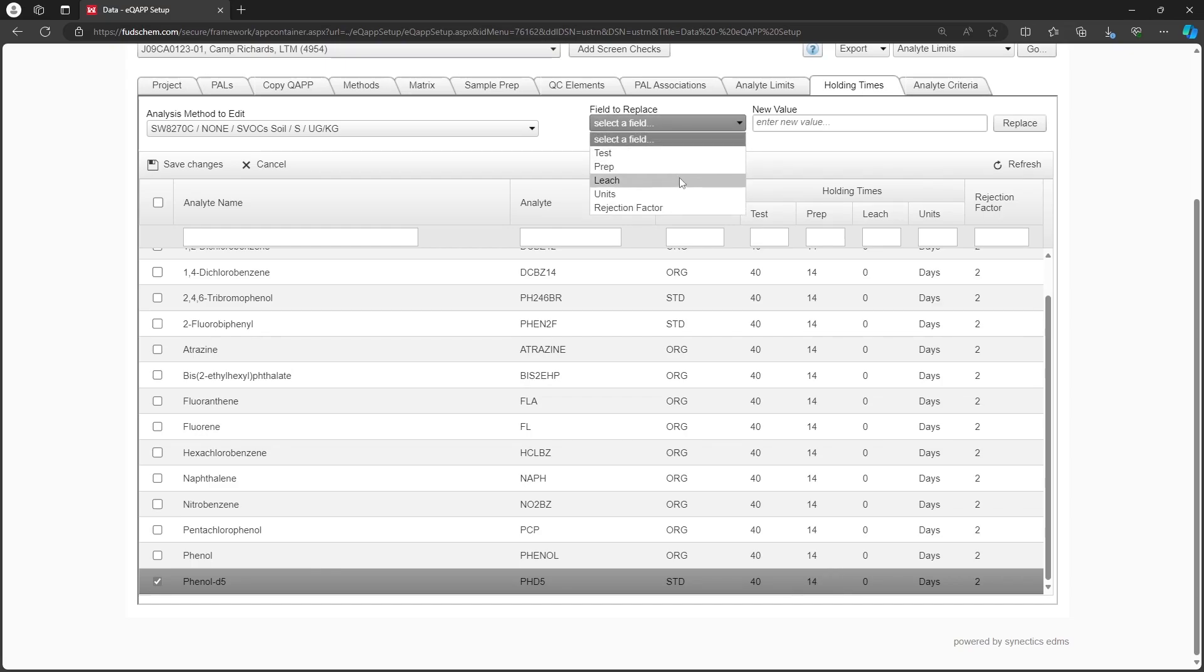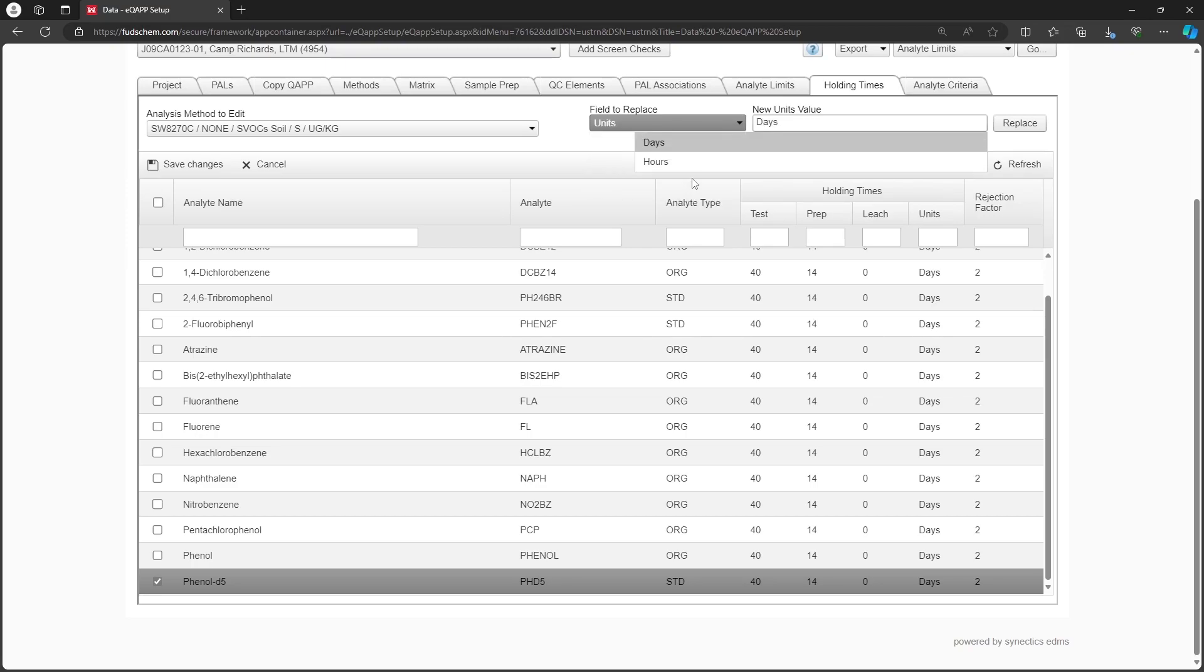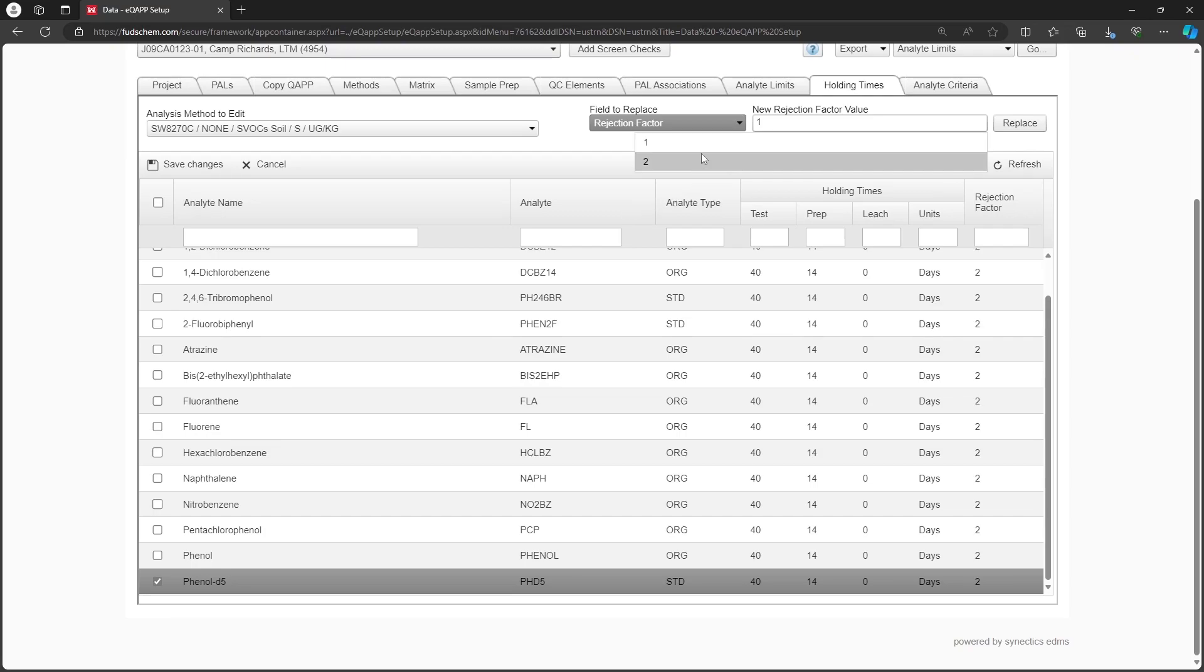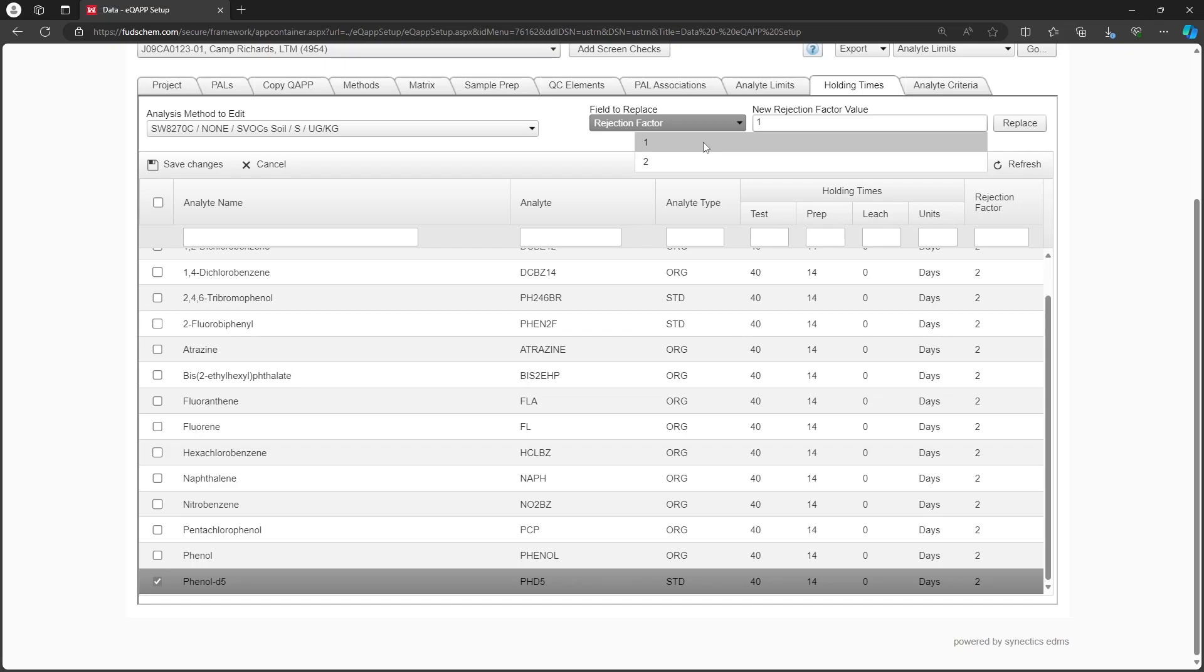The units can also be updated to either hours or days. The rejection factor calculates the gross hold time for the project. Some projects do not use gross hold times, such as those using National Functional Guidelines. In these cases, the rejection factor would be 1. In other projects, the gross hold times may be 200% of the holding time, in which case the rejection factor would be 2.